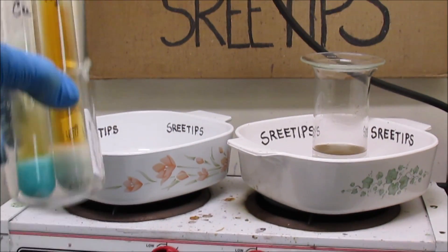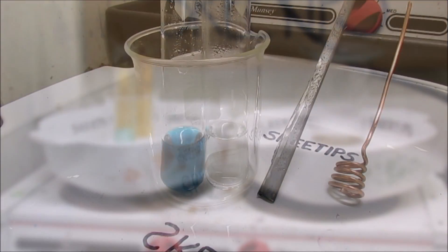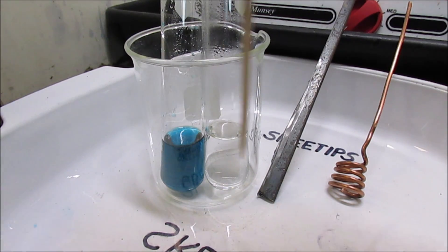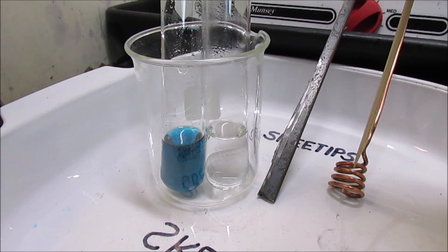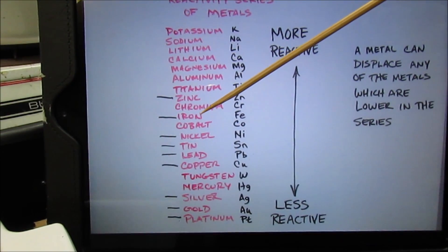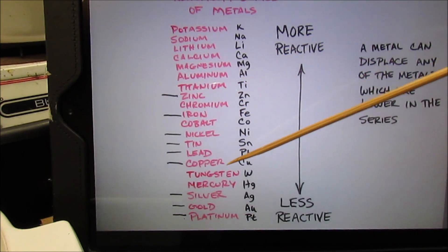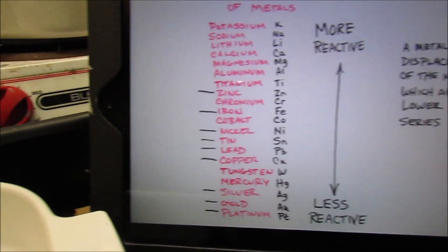I'm going to put these up here on the heat now and add a little bit of heat to get those things to dissolve. Here I have two of the most common solutions that I deal with — copper in a nitric acid solution and silver in a nitric acid solution. Here I've got a piece of iron and here is a piece of copper. I'm going to demonstrate that in accordance with the reactivity series, iron being higher up in the list and therefore more reactive will displace the copper, and copper being higher in the list than silver will displace the silver.